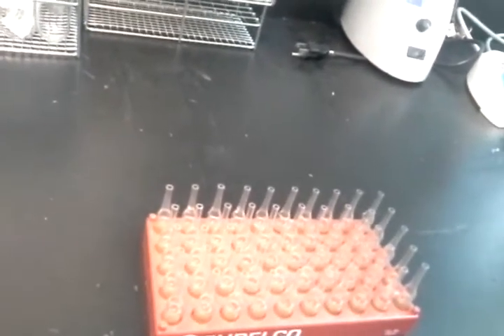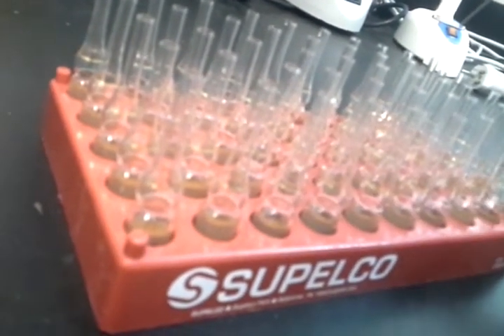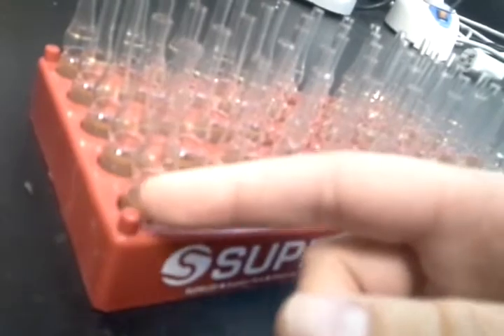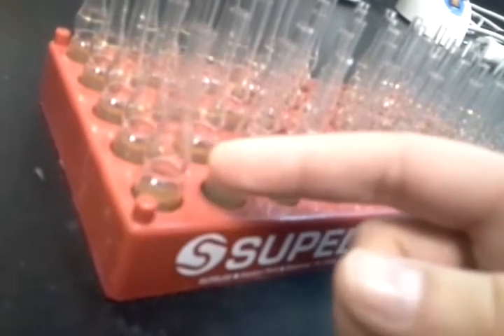These are what I'm working on — little vials full of organisms. In this case, the bacteria is Staphylococcus aureus. That's the organism I'm working with.